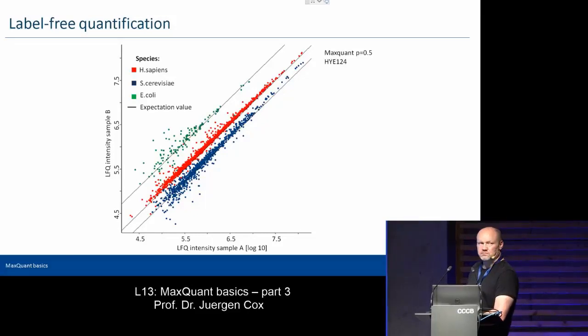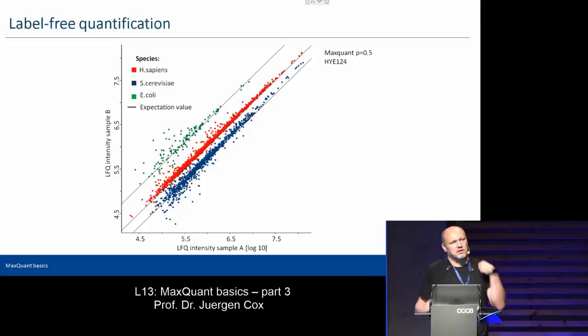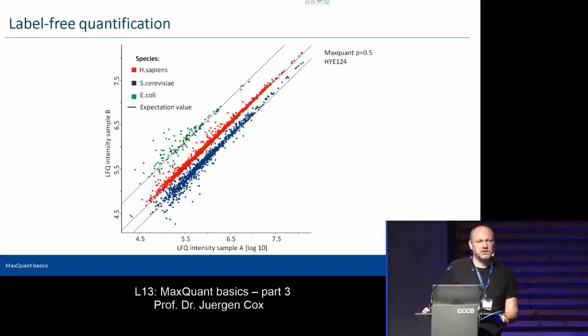I was wondering how much the algorithms and the general workings of MaxQuant have changed since the early days, and whether we should reanalyze old raw files with the updated versions every few years. Yeah, of course it is changing, unavoidably. If we have a major development effort, then it will also change. We always hope for the better, so we always recommend using the latest version possible.